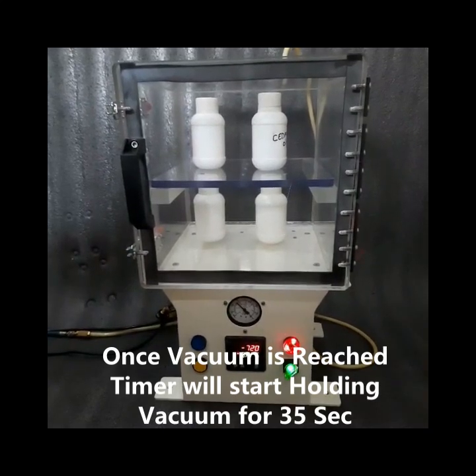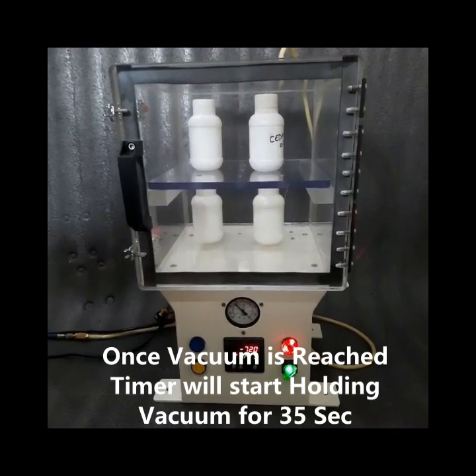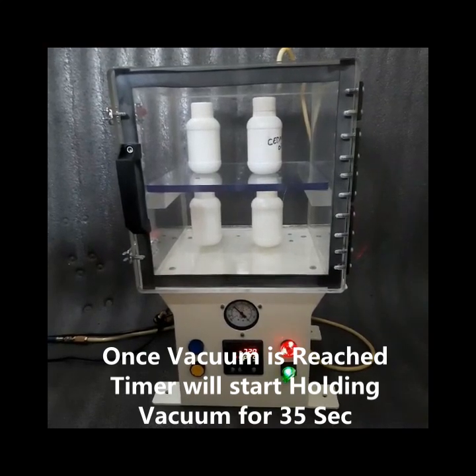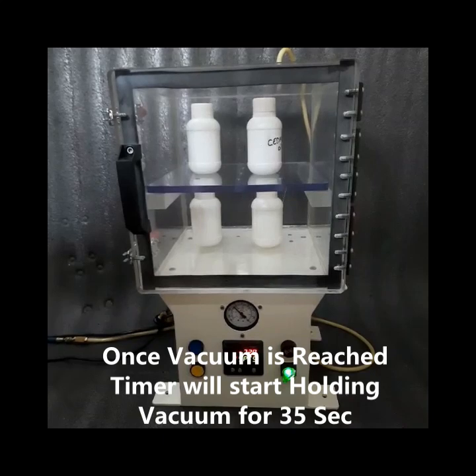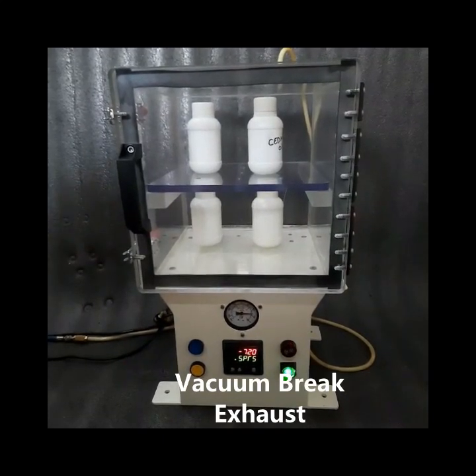This is indicated by a buzzer with a red indication lamp. The timer is running. 35 seconds is now done.